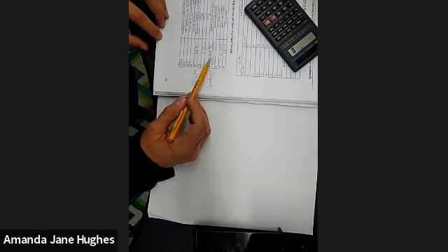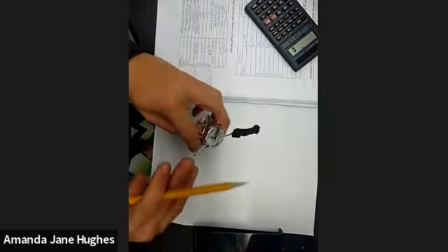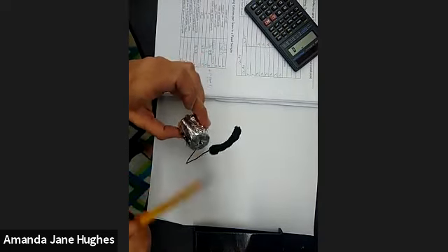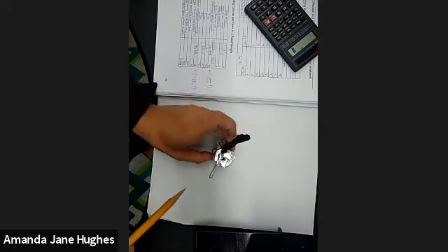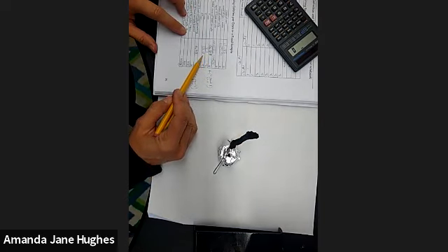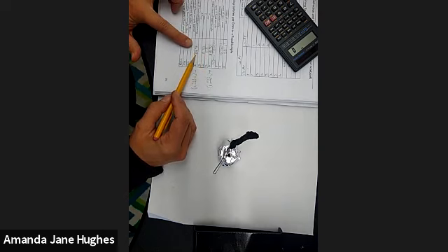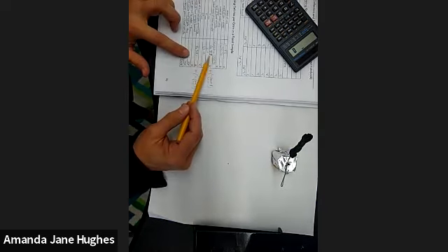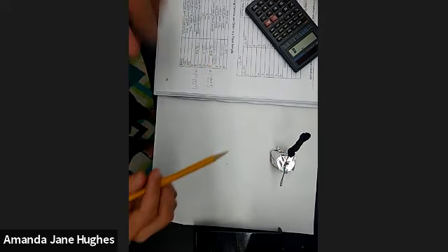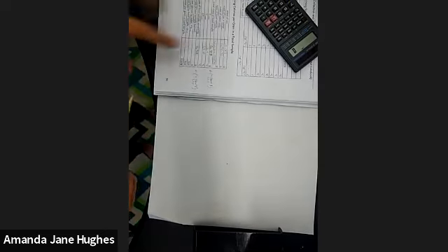So I have my initial food mass, which I again weighed this entire unit, which included the cork, the foil, the paperclip, and my Cheeto before I burned it. So that weighed 6.85 grams. I took the initial temperature of water. I took the final and the highest temperature of the water. And then I weighed the mass of the food sample that was remaining. So again, I just reweighed this entire unit on the top loading balance. And so the difference between these two masses would give me the amount of mass of food sample that was burned. All right, that's pretty much all of the data you needed to collect.